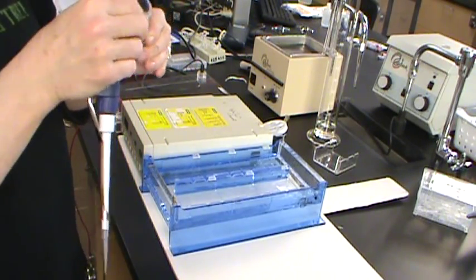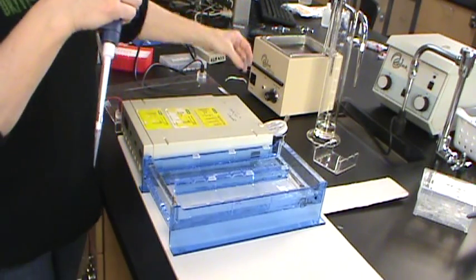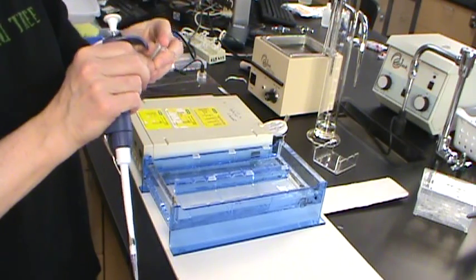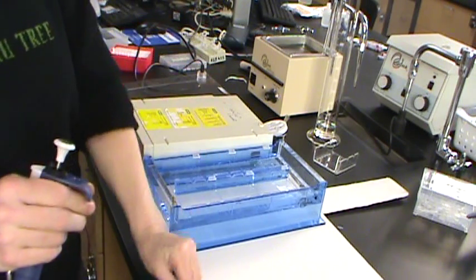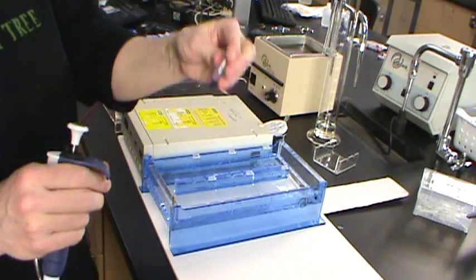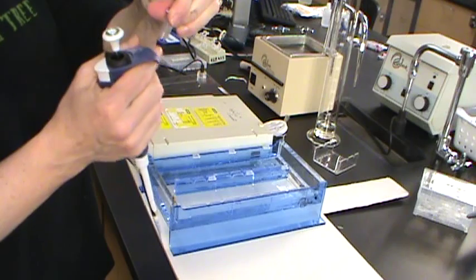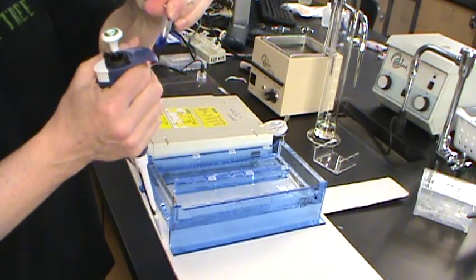Make sure you cap everything. We have very small amounts of reagents, but it will be oodles for all of our classes as long as we're careful with everything. Tap that down, or alternatively use the microcentrifuge to mix your samples.